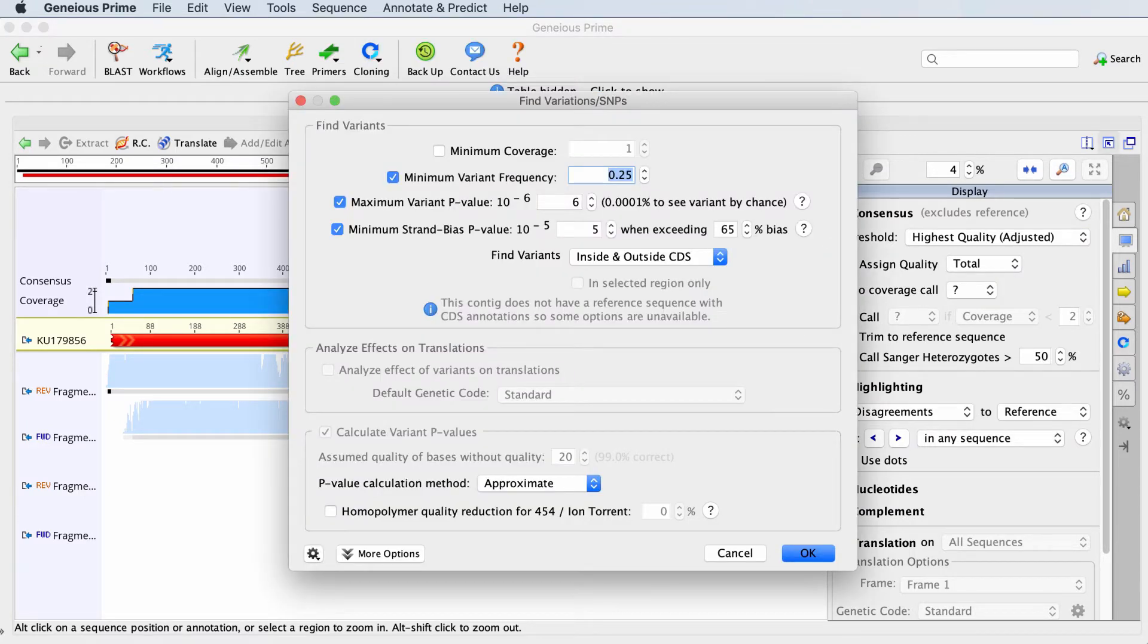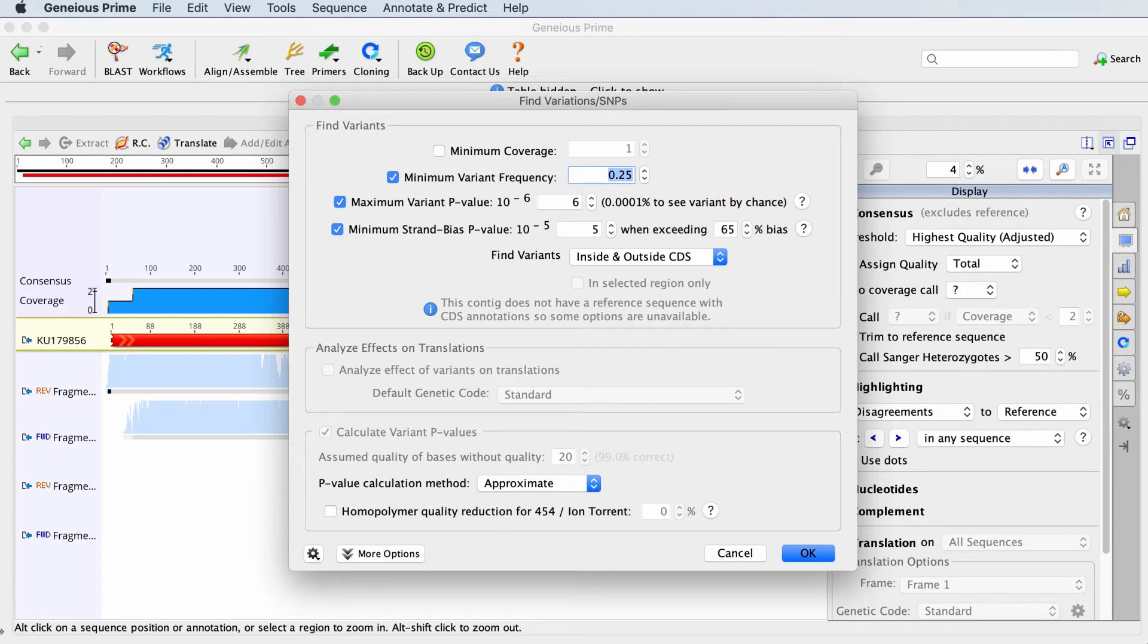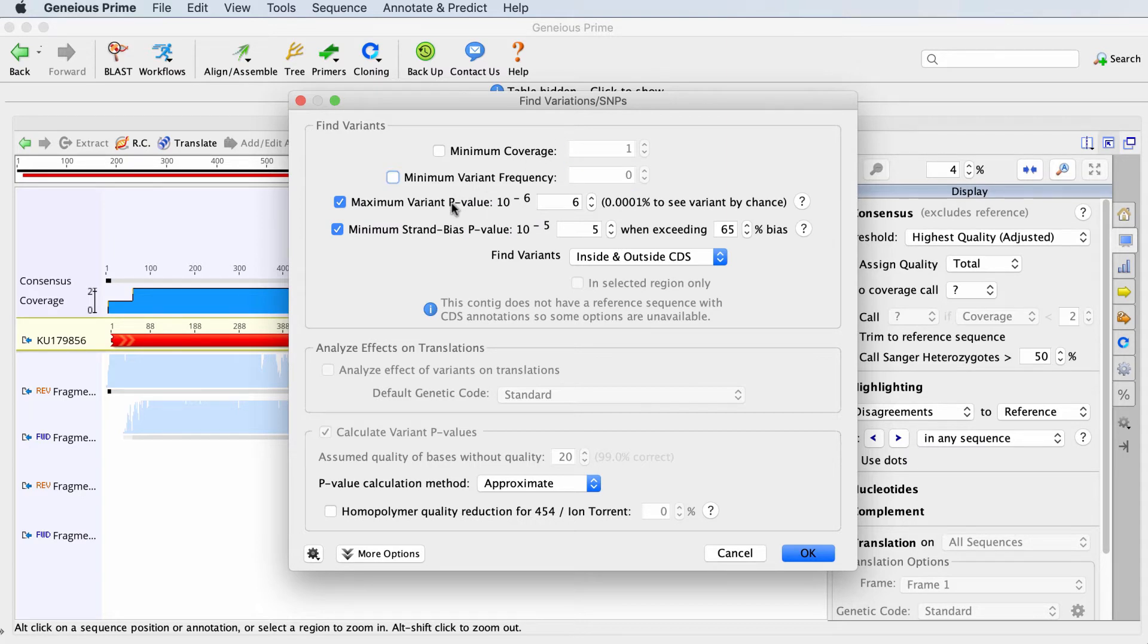The options in the top part of the panel allow you to set the parameters for when snips are called. For chromatogram data, you may be interested in any disagreements, so unselect all four options.